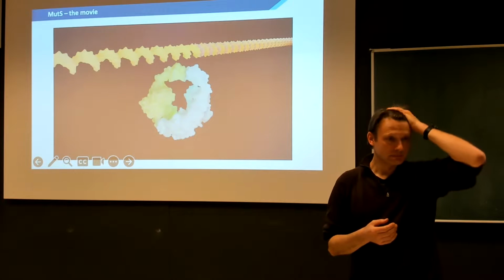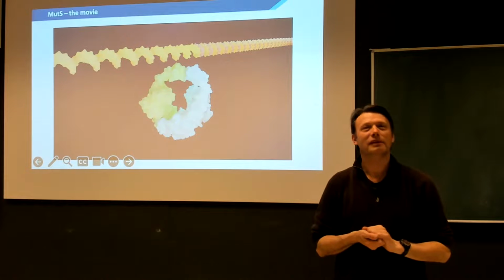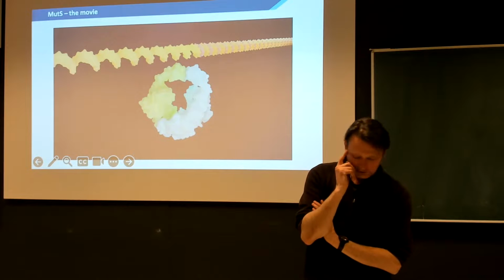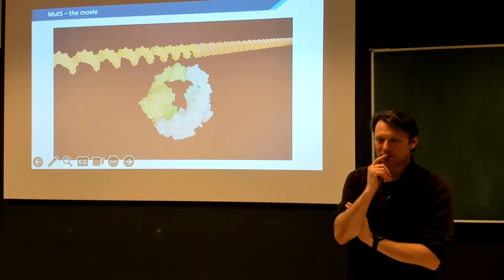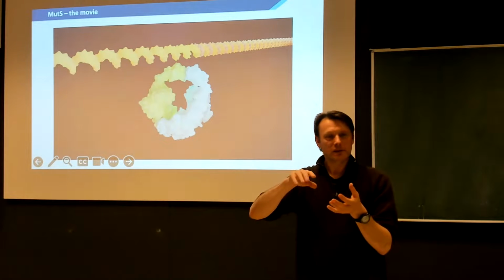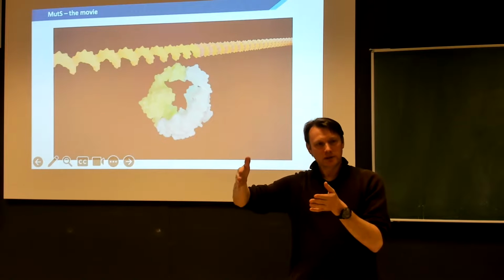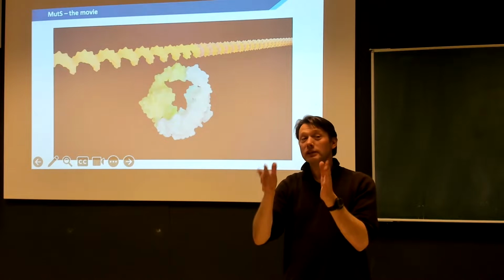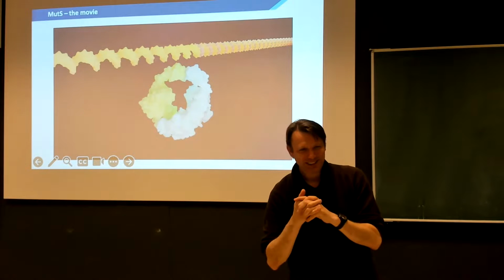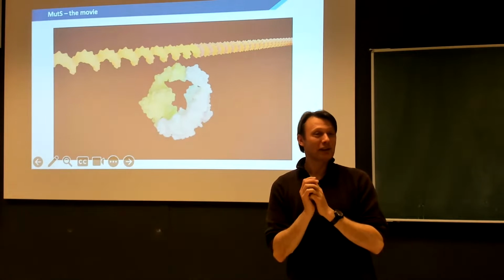So that was a beautiful piece of detective work on figuring out how they work. What is the next step? What is the next big question you're going to figure out? I have a big question and a small question. The small question is this flap endonuclease that can cut off the flap, that's easy. There are structures of it, but it could also recognize this RNA-DNA junction, and I would love to see that structure. Now it's really small, so that's going to be crystallography, and I'm a bit hesitant to do that again, because I swore not to do crystallography again. So that will be the small question. I think that would be really nice.